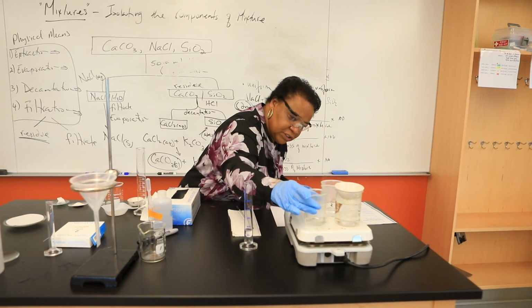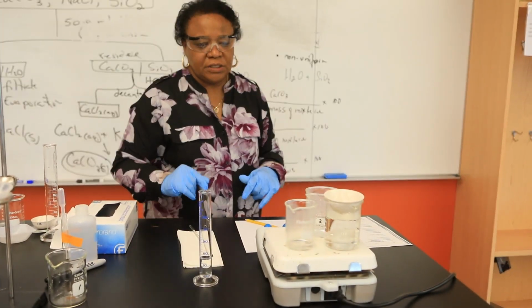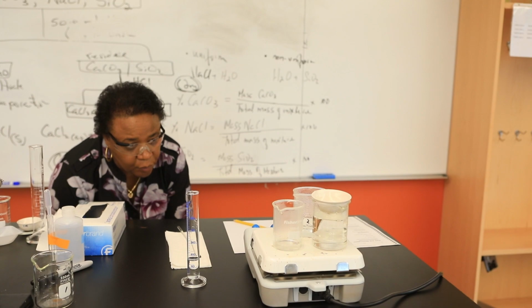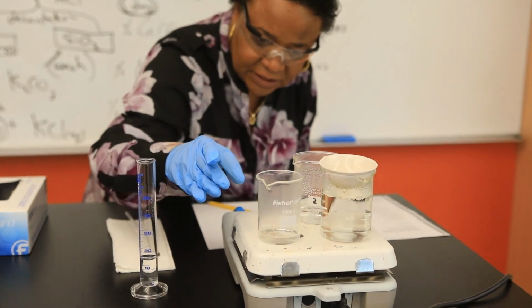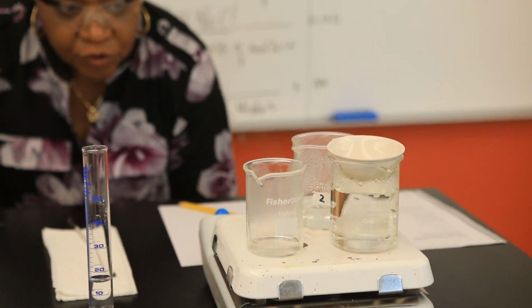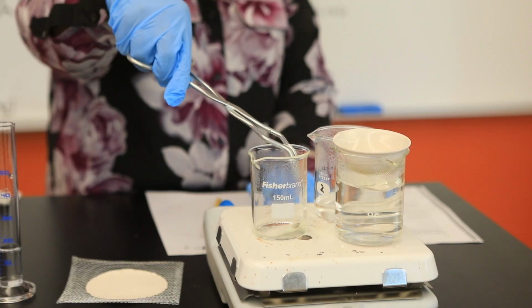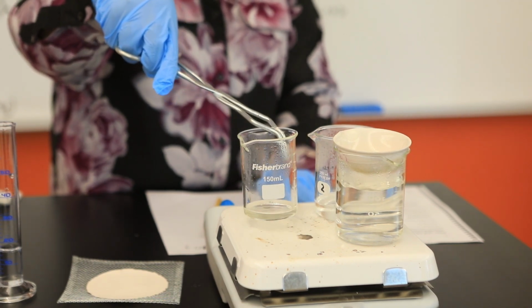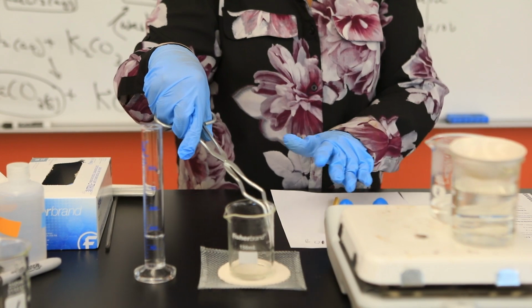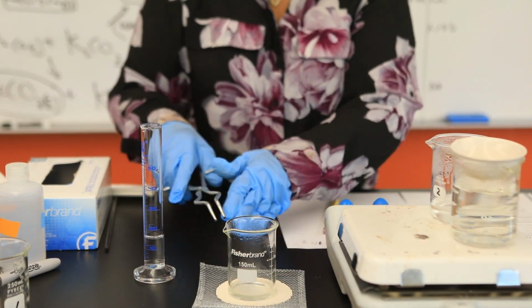Alrighty, so if you pay close attention to my calcium chloride solution, you will see it's now beginning to boil. And I'm going to allow that to go. I saw a few bubbles a second ago. And so I'm now going to start timing for approximately 5 minutes. This has been boiling now for 5 minutes. And so using our tongs, I'm going to transfer this to a wire gauze, just to make sure we avoid damaging our bench tops.